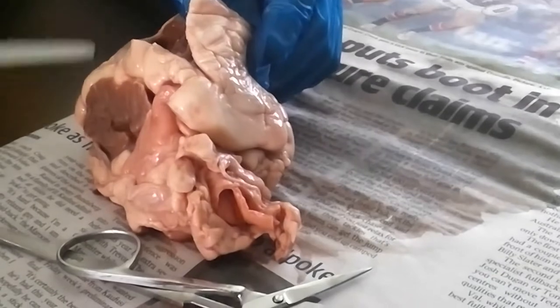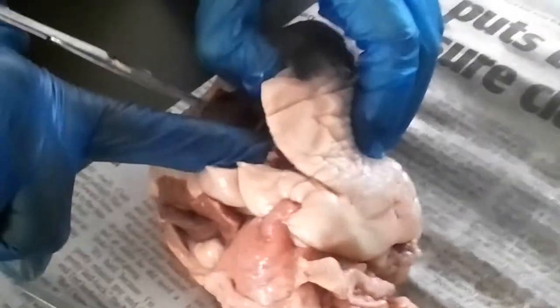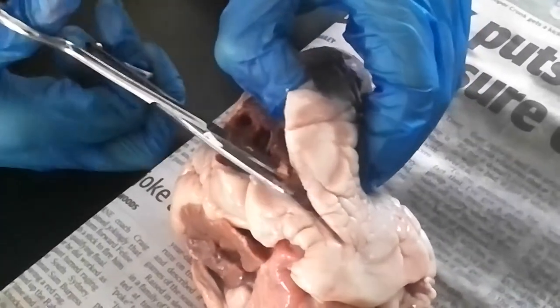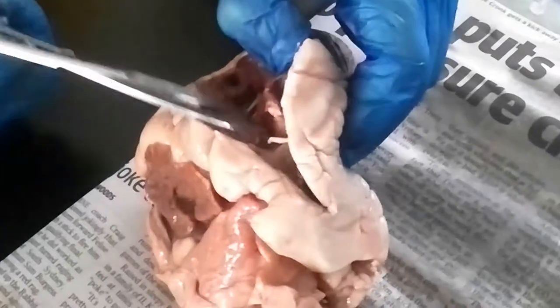Oh wow, that's awesome. See if you can get a bit deeper. So there's your bicuspid valve there. You can see it's quite stringy in there. That's really awesome. So let's cut it a little bit deeper so then you can see the atrium at the top and the ventricle at the bottom. Yeah, that's good. Can you cut that a little bit deeper? But that's awesome.